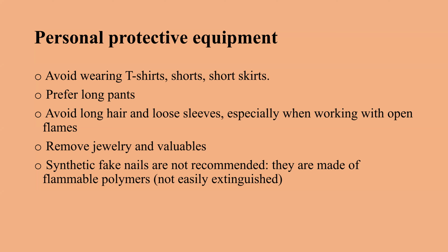Also, a very big danger is synthetic nails, which are usually made from polymers. They are very flammable, and in such a situation very difficult to extinguish.